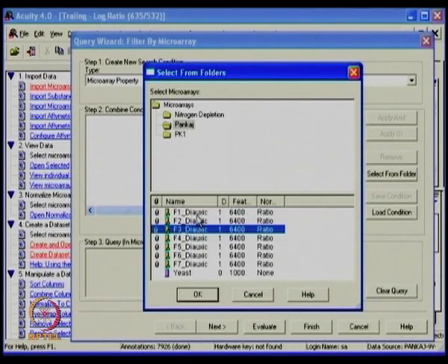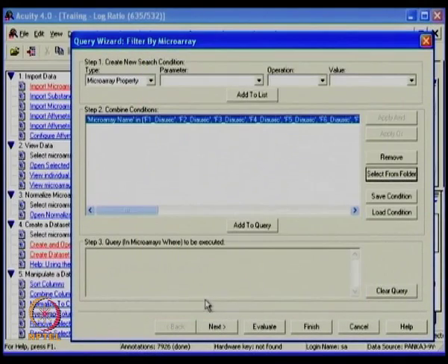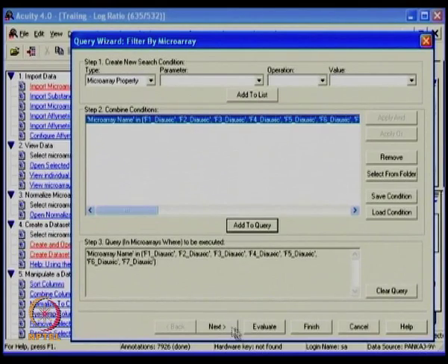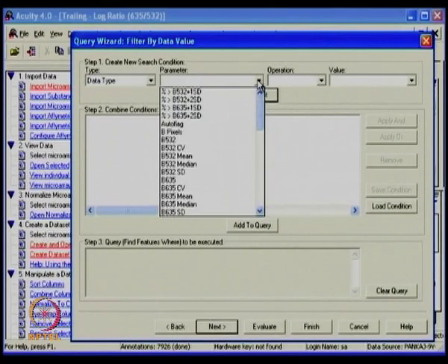What happens is that in the same fashion it creates a query, you can add a query, and it can be created in this fashion. Once you have done that, you say which parameter you want to select. I can quickly do this for you: I want to take a ratio based one.